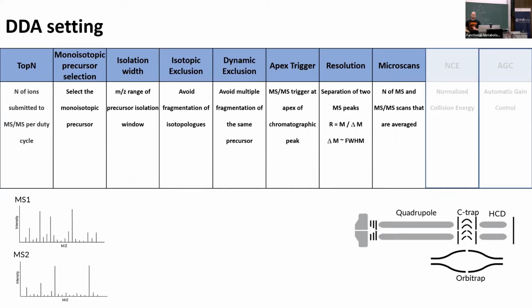Also, I know from Hannes Link's lab, with whom we are sharing our mass spec lab, they have an Agilent QTOF, and that's a central setting, the number of accumulated scans. For us on the Orbitrap, for metabolomics, we typically use 1 microscan as default.